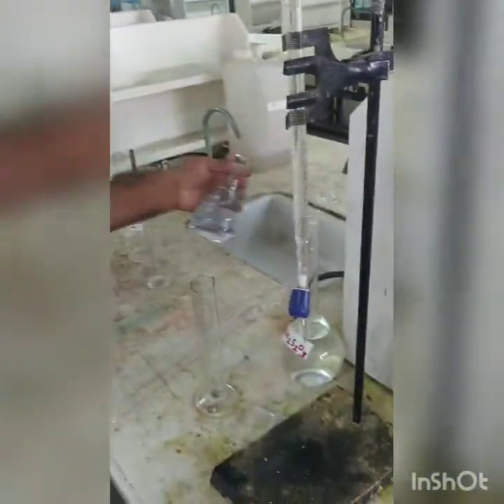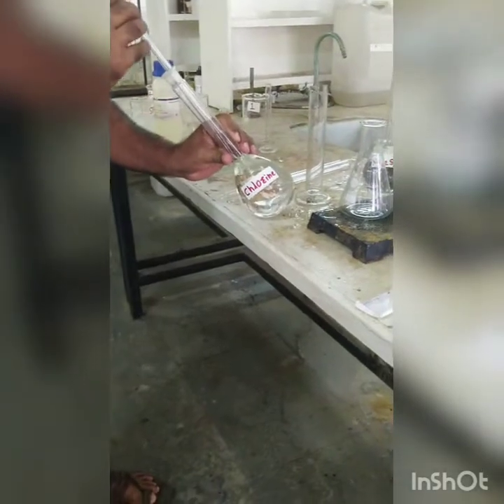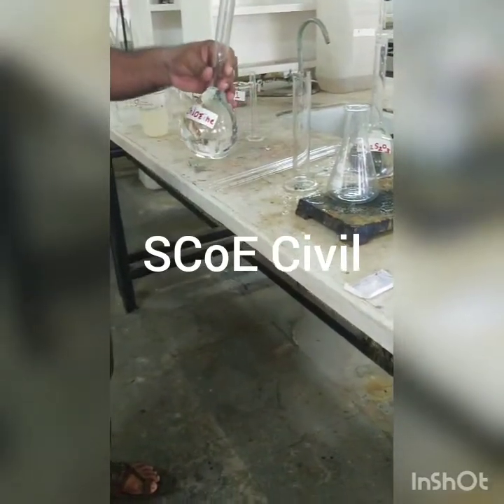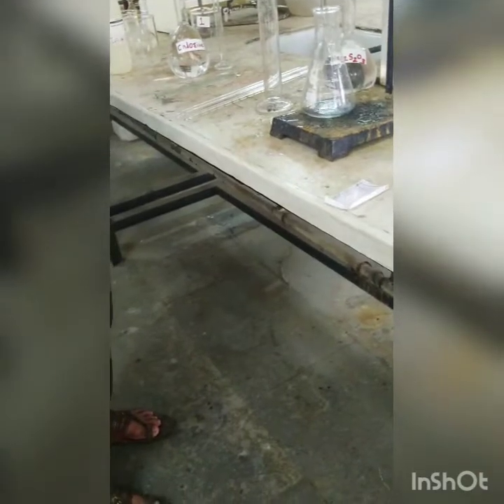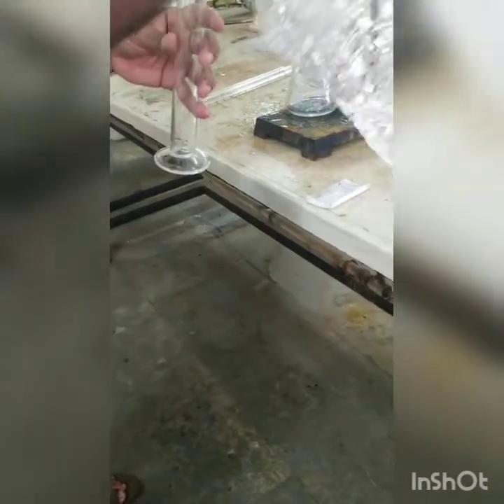You can see, first, they have mentioned starting with the determination of concentration of chlorine in the given chlorine solution. So for that we have to extract 10 ml of chlorine solution in the conical flask. To that, as usual, we are going to add 100 ml of distilled water. So 100 ml of distilled water is being added.